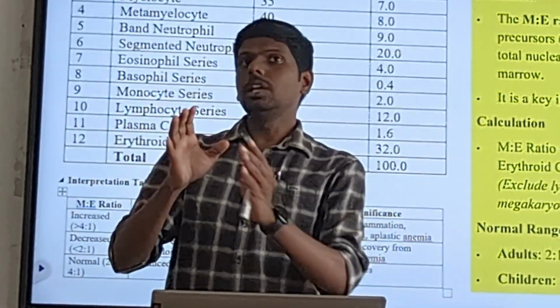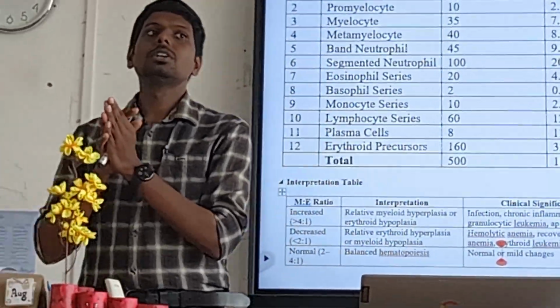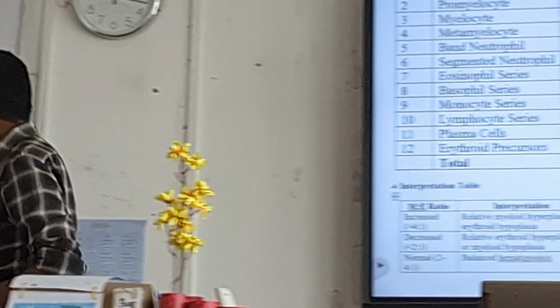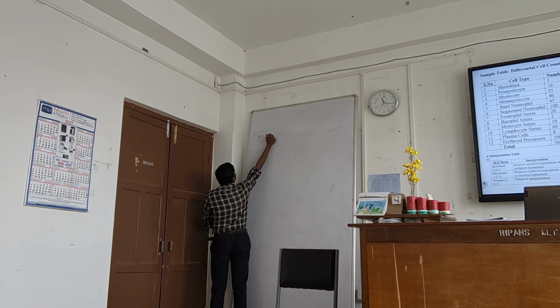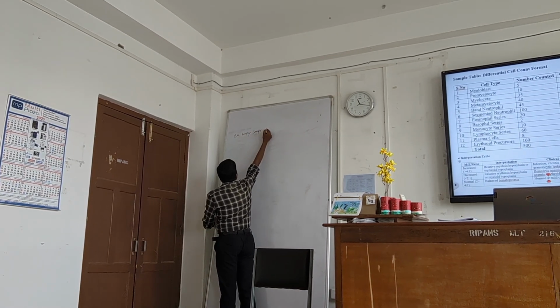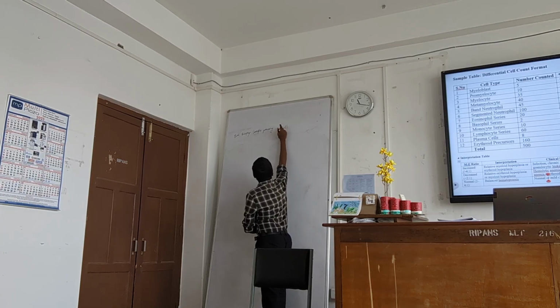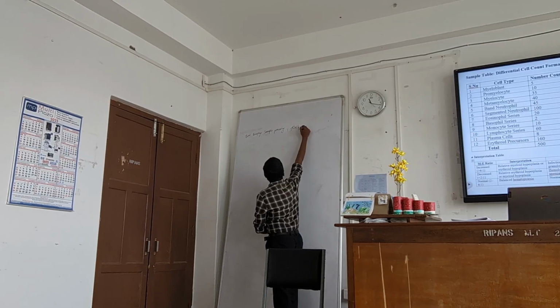Now, in today's lecture, we will discuss bone marrow biopsy sample processing and its interpretation.